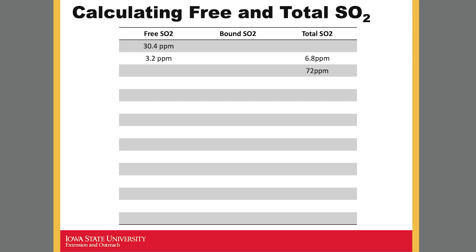Another source of error would be the strength of sodium hydroxide, in the sense that if you don't use exactly 0.01 normal, let's say you prepare your own concentration of sodium hydroxide, you will need to standardize that. Because if you don't, you're going to have a strength that is not accurate, and when you do the titration, you will not have the correct value. So you need to make sure everything is standardized, and if you create your own solution, you standardize your solution before making any calculation.